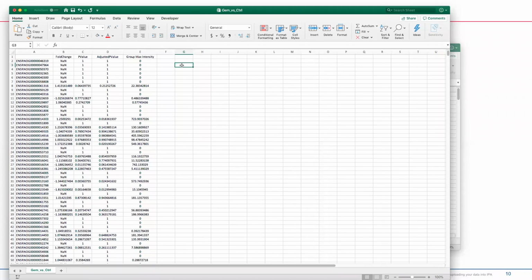And you'll also want to carefully look over your data, because sometimes if you convert, say, a text file to an Excel file and you have a gene like Sept7, for example, Excel is going to think that's September 7th and it's going to make that conversion. Or you'll see a calculation for minus infinity and it will turn into a formula error. So instead, what you can do here is put an apostrophe in front of it, and Sept7 will stay Sept7.